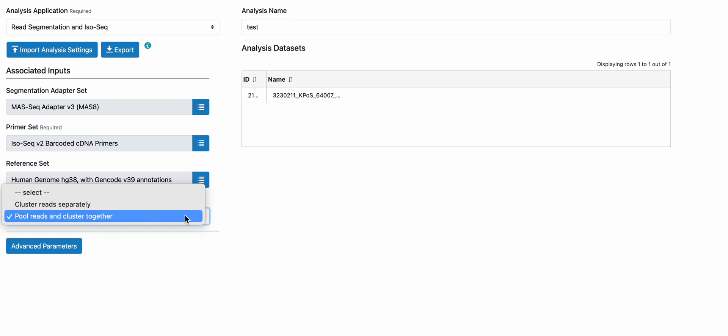In one output file, it will show the per sample read counts. You're getting one final isoform classification file with the per sample information. It will show you what that looks like in terms of file output.